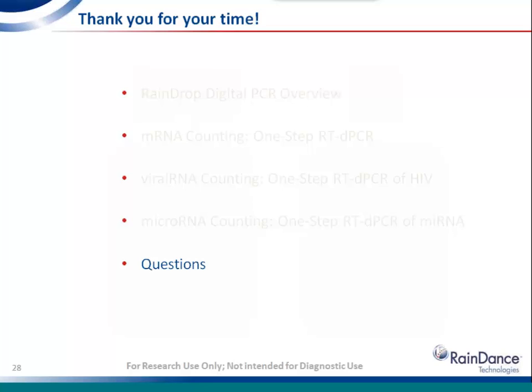What kit was used for the microRNA data? As I described, I didn't want to say this is the only system that can be used, but commercially for measuring microRNA using qPCR, the TaqMan assay from Life Technologies was used for this. And I hope I was able to illustrate the reason why this is a very interesting product is that the microRNA, because it is short, doesn't give you a lot of room for both primers and probe to hybridize if you only have 22 base pairs.